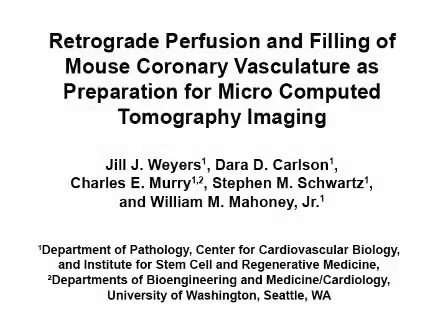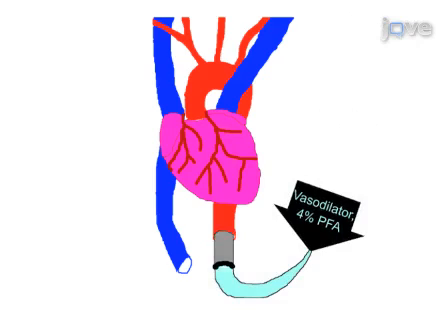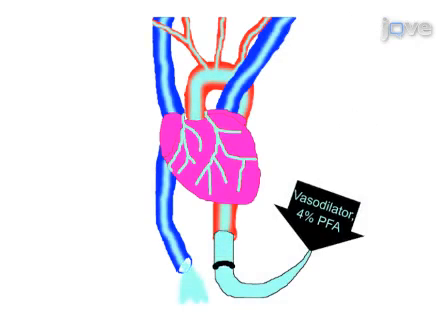The overall goal of this procedure is to fill the coronary vasculature with a radiopaque dye in preparation for microcomputed tomography, or micro-CT, imaging. First, the mouse's abdominal cavity is opened and the abdominal aorta is cannulated. Then the vasculature is perfused with a vasodilating buffer, followed by perfusion with a fixative. The vessels are then ligated both to direct the perfusate as well as to block potential leakage points.